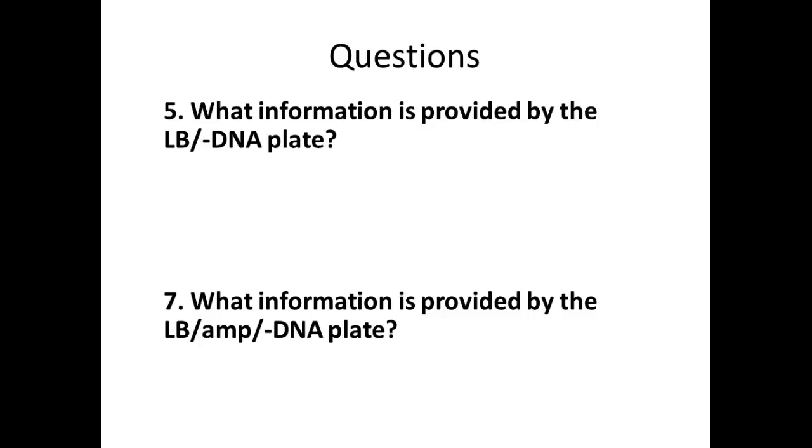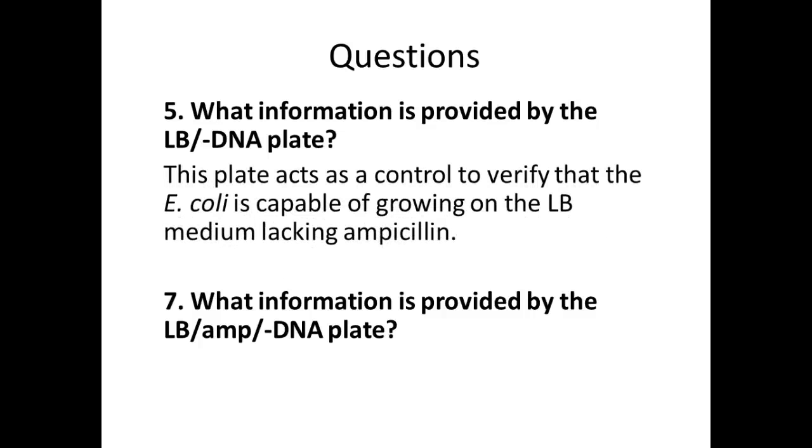There's nothing in this media that's going to stop them from growing. And this is our control to make sure that our bacteria can grow on this media and that it survived through this experiment, right? That we didn't kill it off. It's capable of growing.